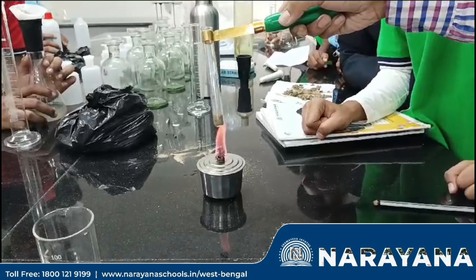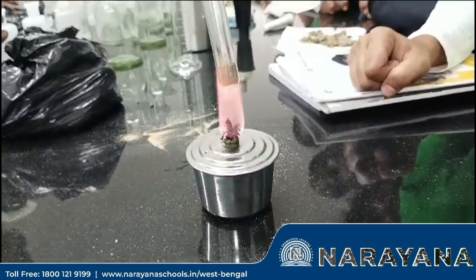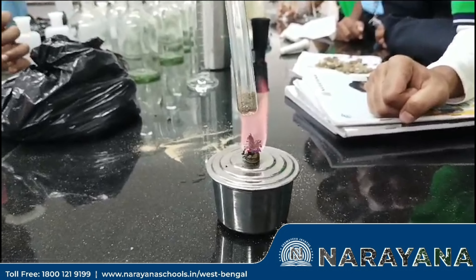Now we have to make it fit, but don't keep these things for a long time, okay? Just make it fit and we have to observe which kind of changes is there or not, okay?